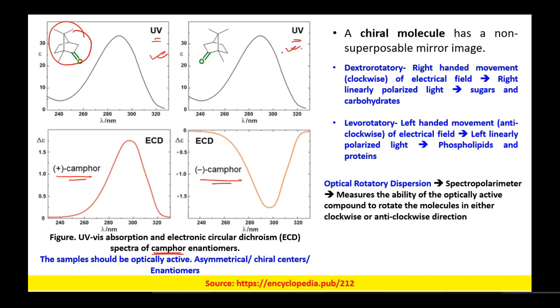However, these dextrorotatory and levorotatory camphor are nothing but enantiomers, and since both of them give a similar pattern, it would be next to impossible to identify whether you have been given dextrorotatory or levorotatory camphor.